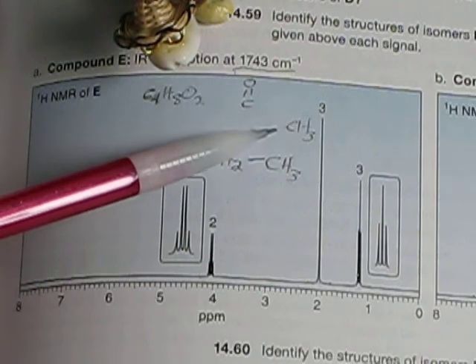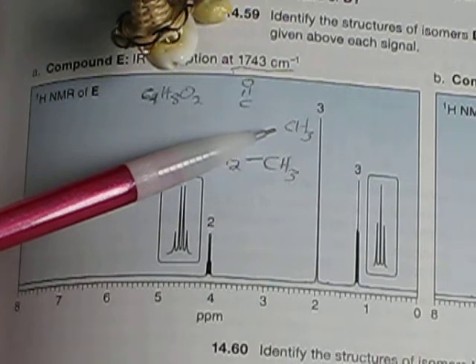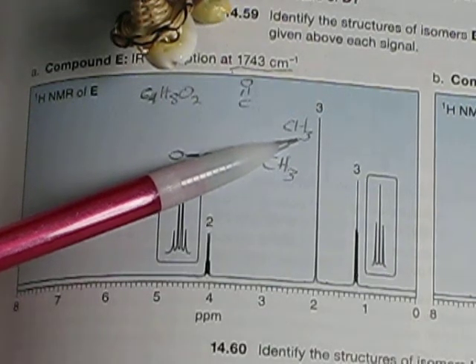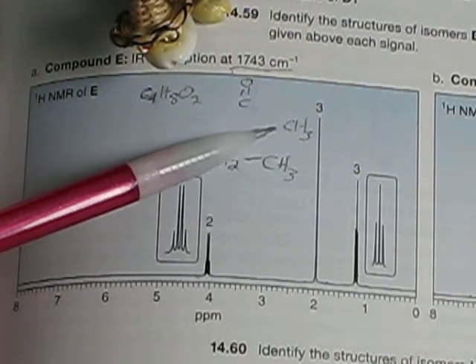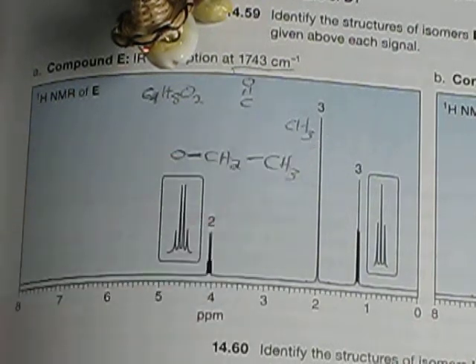There could be an oxygen next door, and then it would be a singlet. But note, an oxygen couldn't work, because if there were an oxygen bonded to this carbon, what would be the chemical shift value of these 3 hydrogens? Yeah, those 3 would come way down at 4 ppm, but they're not at 4 ppm, they're at 2 ppm. Well, what will bring resonance down to 2 ppm? Because saturated alkanes are about 1 ppm. What will bring it down 1 ppm in value down to 2 ppm? Well, if you look at our sheets, we find carbonyls can do that.